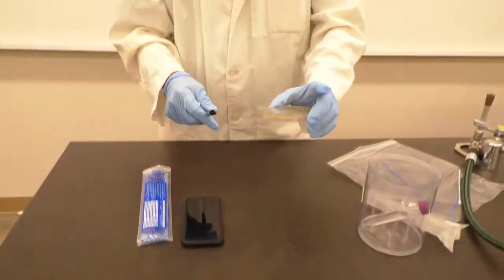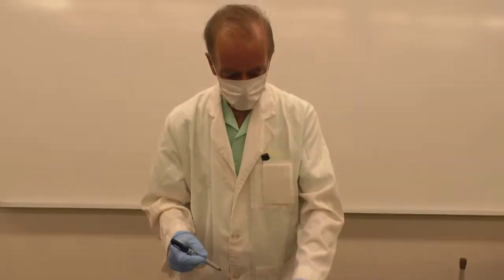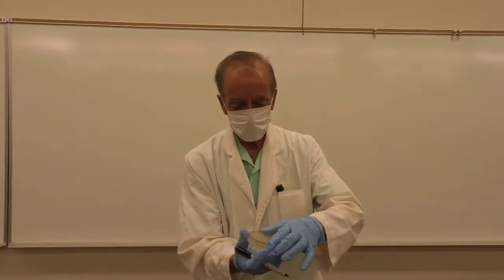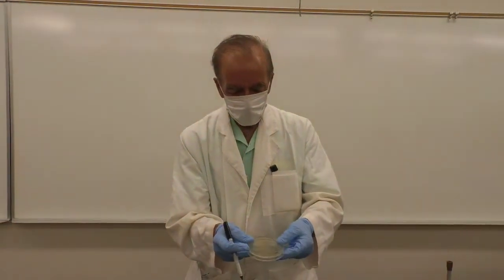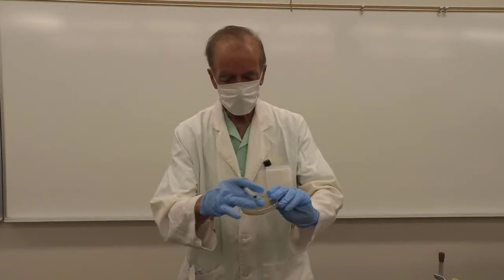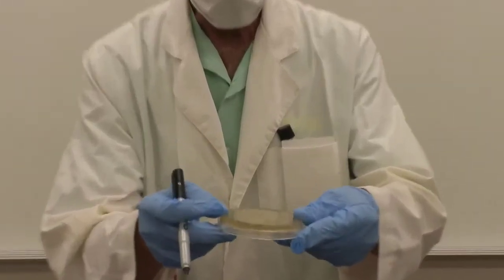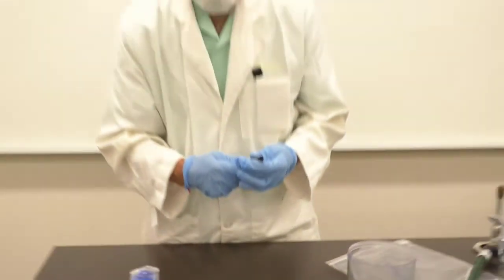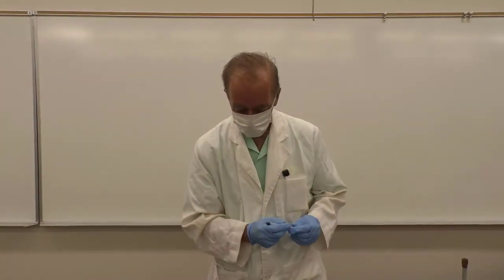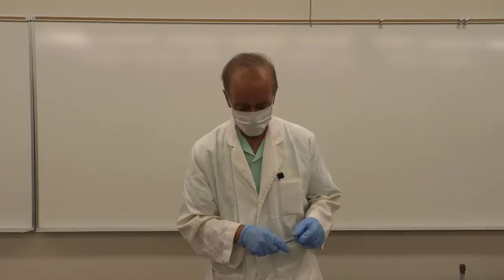Okay, this I'm going to incubate on top of my refrigerator. Always incubate the plates inverted. The reason you do that is sometimes there's condensation on the top that can smear your colonies, so always invert the plates. Okay, very good. Let's hope we get some growth and see what's contaminating my iPhone.